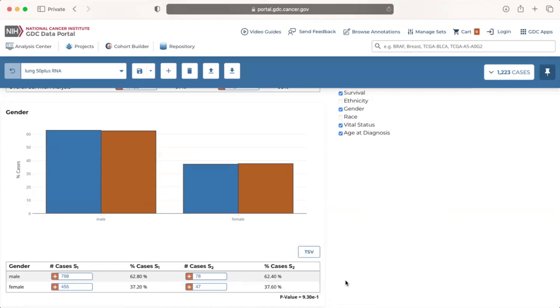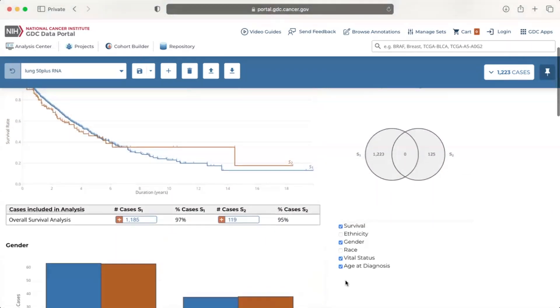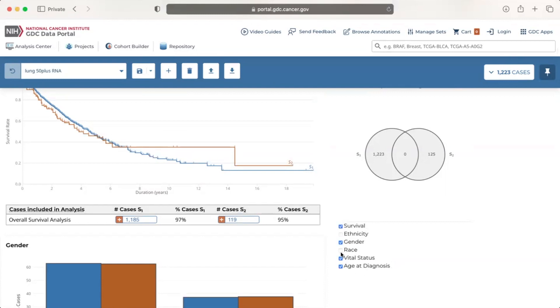Underneath the Venn diagram is a list of available clinical facets. As mentioned, the visuals for survival, gender, vital status, and age at diagnosis are already displayed as indicated by the check marks in their corresponding boxes.